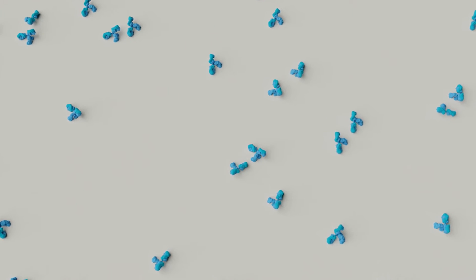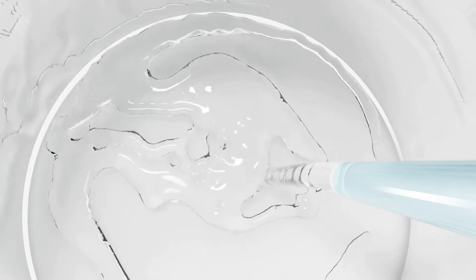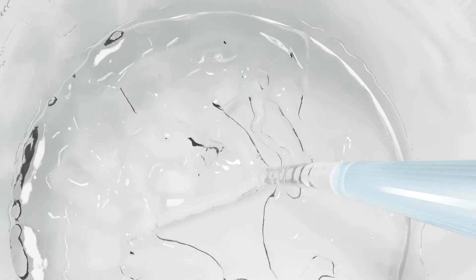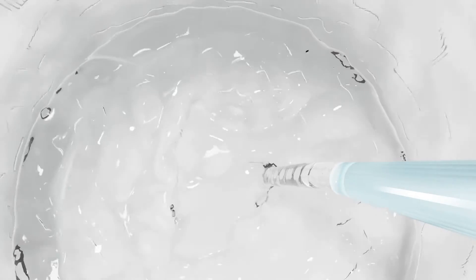Our example is a sandwich ELISA for gamma interferon. The bottom of the well is populated with an antibody specific for gamma interferon. The first thing we want to do is to add the samples, controls and standards in each well. Now we need to get closer to see what is happening into the well.